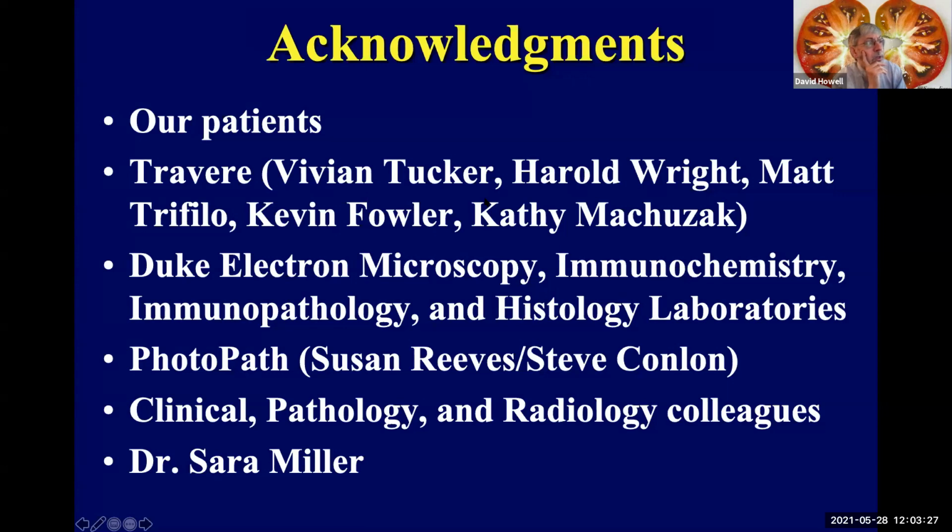So I would say thaw it slowly, and if possible, thaw it into fixative. Our laboratory actually uses gelatin to embed the specimens for immunofluorescence staining. So you have to warm them up and get the gelatin off before you fix them. But you want to get them into the fixative as rapidly as possible, and it's best to thaw them sort of gradually. Those are sort of the main tricks that our laboratory uses. Okay.